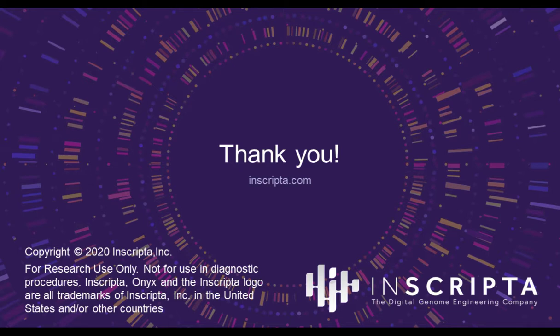That's why we have the instrument that is running in the lab, and we have the microfluidics components to make sure that we are able to design these thousands of edits in one library, and that we can do both the substitutions and the insertions and the deletions, and you can basically mix that up into every library. And because this is working in single cells, that's the reason why you can actually do this.